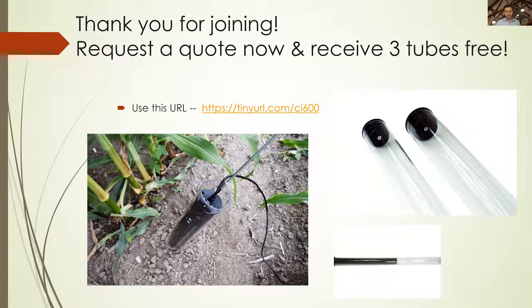What is the recommended DPI for studying root hair and mycorrhizae? Ooh, 600, 1200. I've seen, because the CI 600 does go down to 600 or 900, I would say keep around there for larger colonies, but I would definitely look into using the 1200 DPI so you can get as good a resolution as possible in your studies.